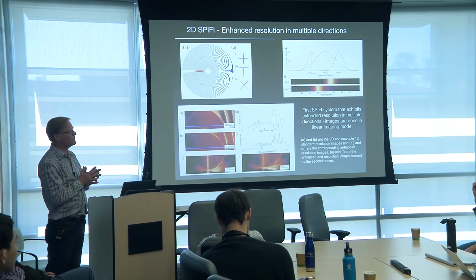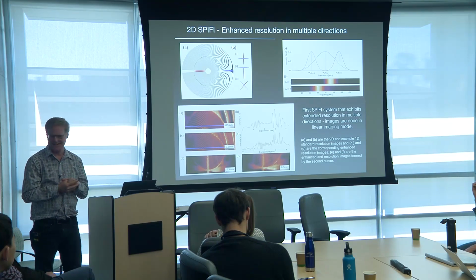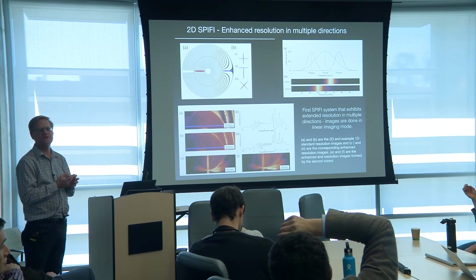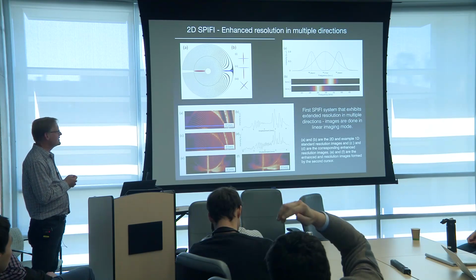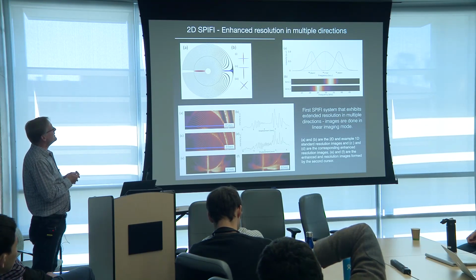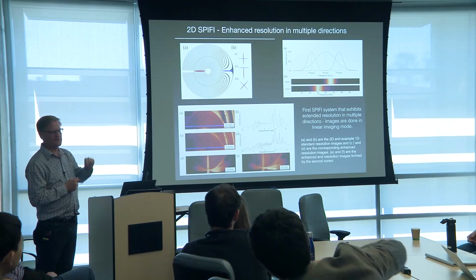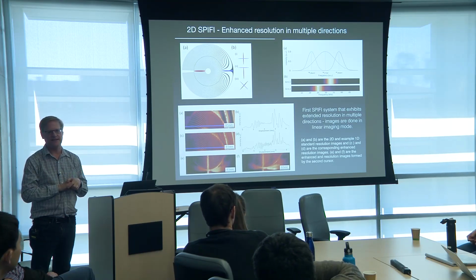And like I said, I got lots of supplementary materials. So if you want to see how our optical transfer function compares to every imaging modality, we can do that. You can see where we gain what I call a factor of 2 and where it relates to any form of microscopy. Do you have a mathematical description of this pattern? Yeah. Where it derives from is basically I want to be able to use Fourier transforms. And so that's what determines the spiral kind of shape, in that it creates a linear step in frequency between the pixels that I'd like to resolve.